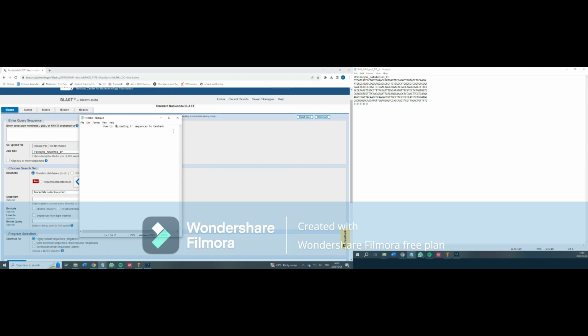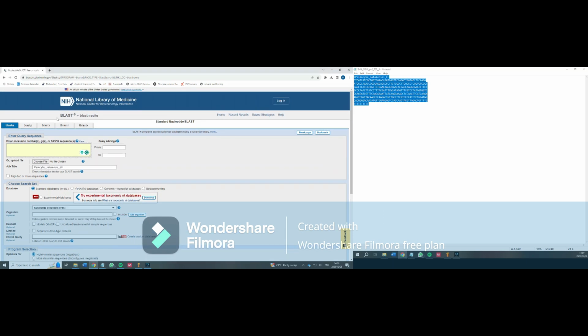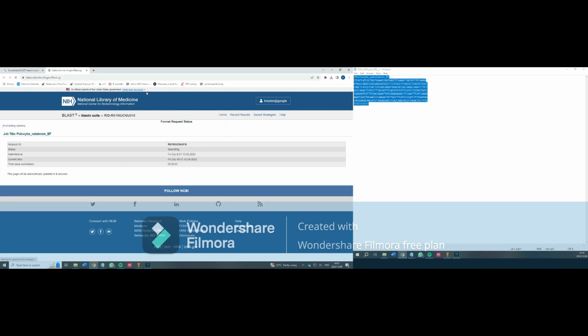So this is a quick how-to on uploading elongation factor or other protein coding sequences to GenBank. So first you take your sequence you've generated. This is elongation factor sequence, and you blast it using the nucleotide blast function on GenBank. You let that load, do its thing.